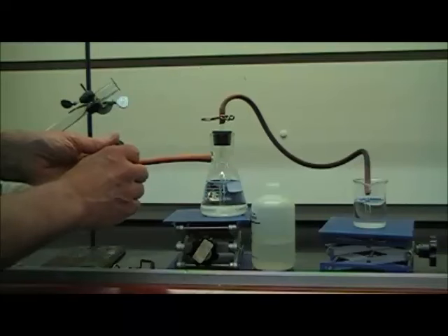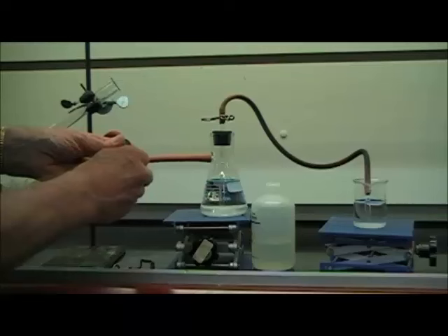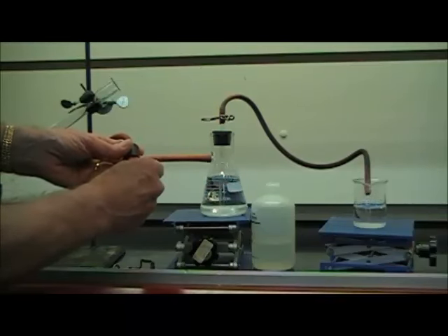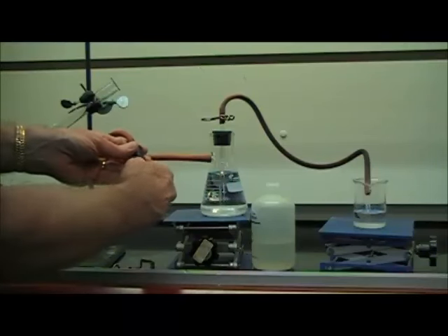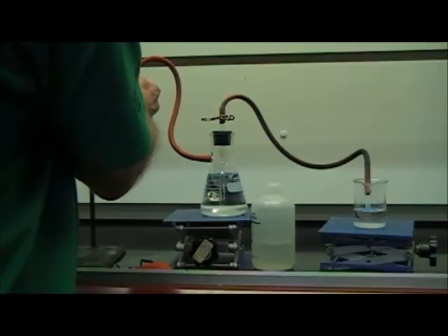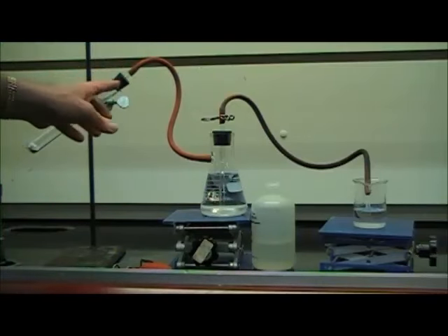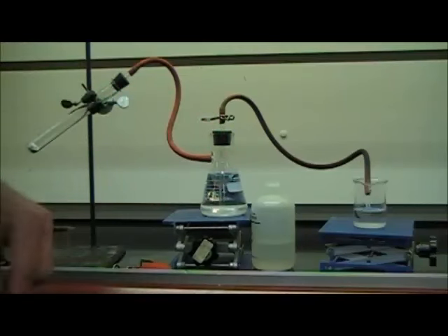So what I'm going to do is, first of all, suction some more water over towards this side so that that container is pretty full of water. We don't want to get up to the sidearm, but we want it to be pretty full. And then I'm just going to quickly attach it onto the test tube. And by attaching it here, no air can get into this side of the system, and so it can't siphon. But this is an important thing we're going to do next.